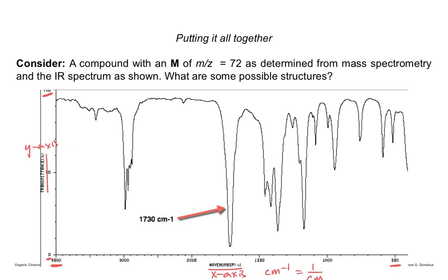So if we're reading from left to right here, if we follow that, that's 100%. And then it's going to get to a functional group where it starts to dip down. That means that light is being absorbed by some functional group in that region. And you can see the region spans 3,500 wave numbers. So the functional groups are in different spots along that x-axis.